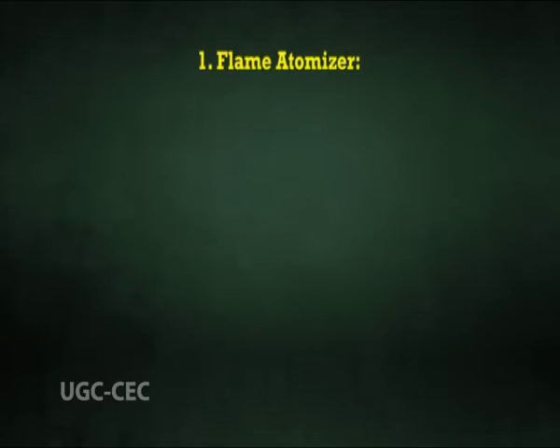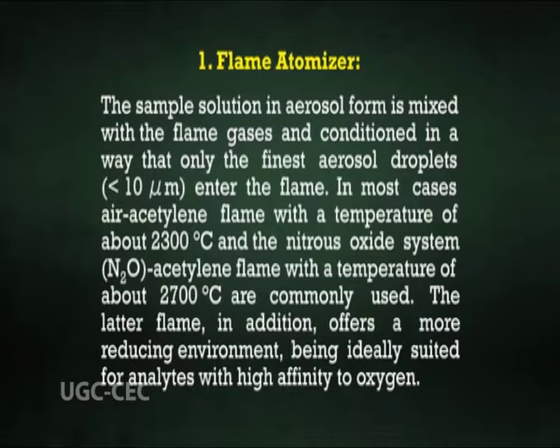Flame atomizer. The sample solution in aerosol form is mixed with the flame gases and conditioned in a way that only the finest aerosol droplets, less than 10 micrometer, enter the flame.